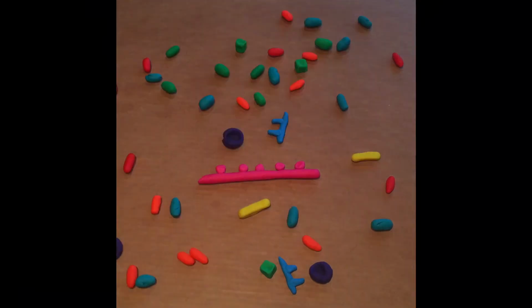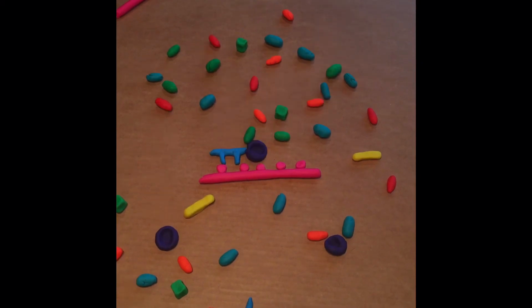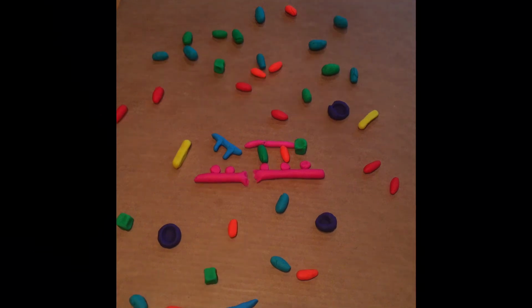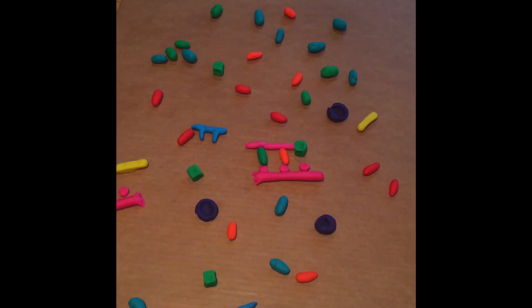Now, a primer and a DNA polymerase attaches to the template strand. The nucleotides are added as normally seen during DNA replication. However, there's a small chance that instead, a DDNTP will be added. These DDNTPs can also contain a fluorescent or radioactive tag for later detection. At this point, the DNA polymerase can't add any more nucleotides due to the chemical makeup of the DDNTP. The remainder of the single strand is unstable and breaks away, leaving a double strand including the DDNTP.